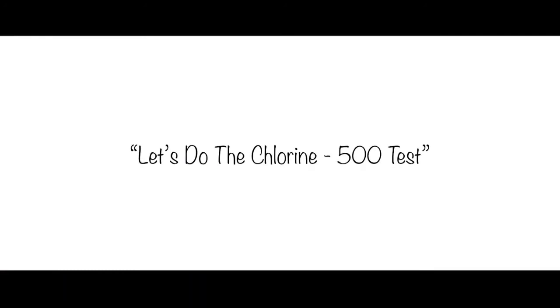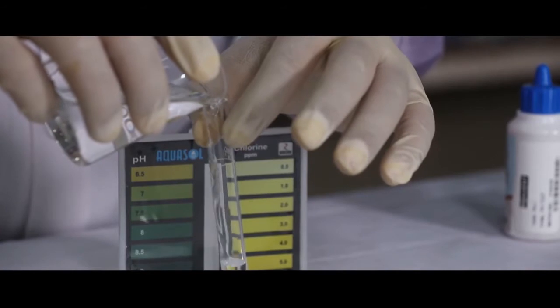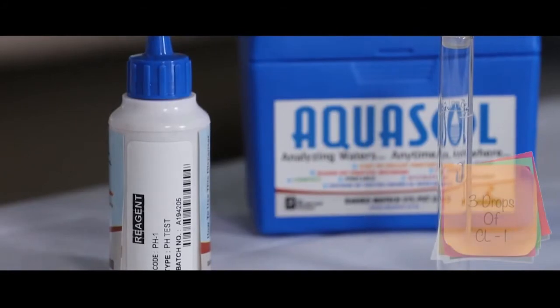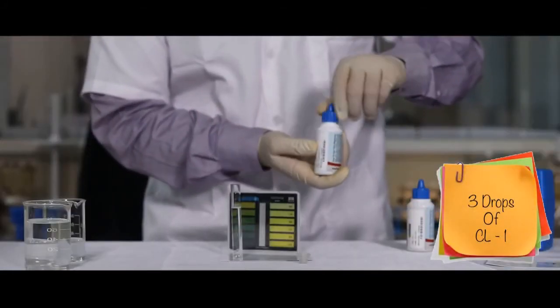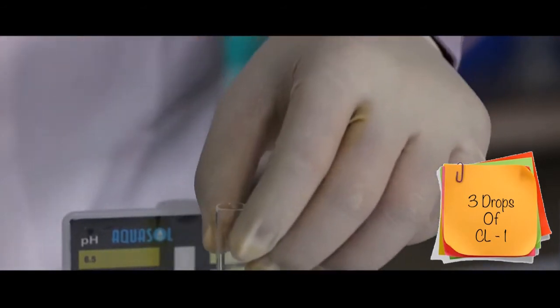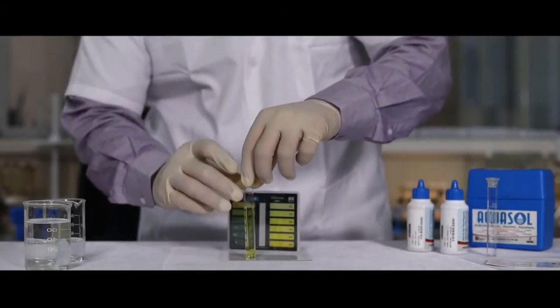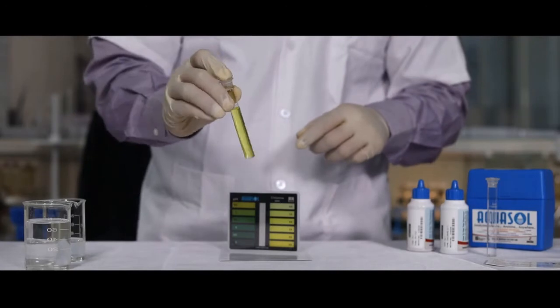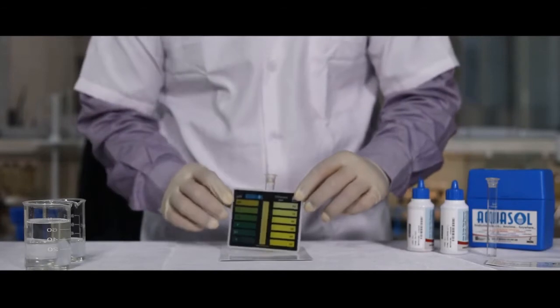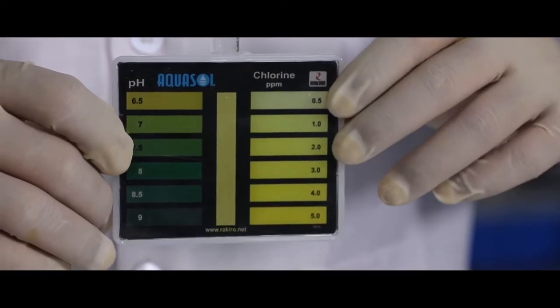Now for chlorine 500, fill the test tube with the sample till the mark. Add 3 drops of chlorine Cl1 reagent. Mix well. Place the test jar in the comparator slot. Match the color to the color chart to know the value of chlorine present in the sample.